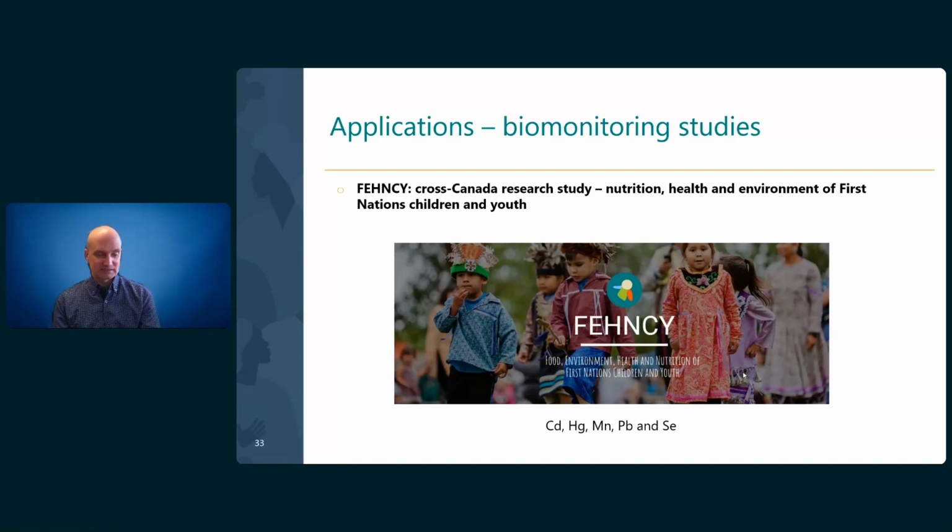For the next phase, they plan to use the Mitra VAMS devices for blood collection, and to analyze for cadmium, mercury, manganese, lead, and selenium in our laboratory with the full method we just developed and validated. This is a study about the nutrition, health, and environment of First Nations children and youth here in Canada.